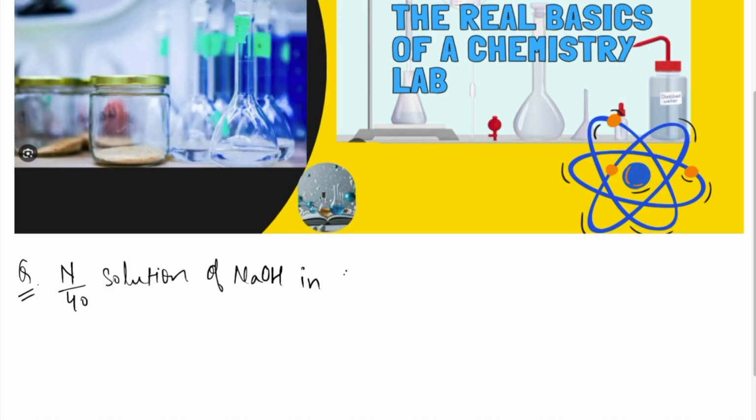In, let's say, a 250 ml standard flask. I'll come back to this part later on, what is a standard flask or what is a conical flask and all those things, in which apparatus we should prepare solutions.